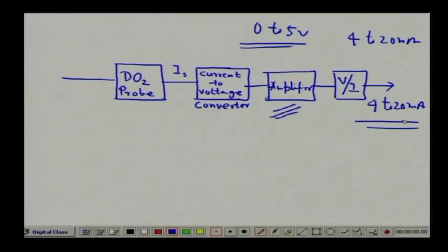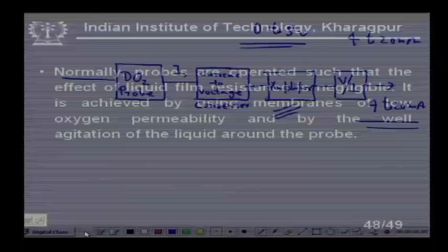Moreover, we made these measurements in bioreactors in the bioprocess instrumentation lab at IIT Kharagpur, and we found consistently good results. When we compare with other sensors there is a slight offset, which is quite obvious. So this galvanic electrode actually worked very nicely in our laboratory, right.